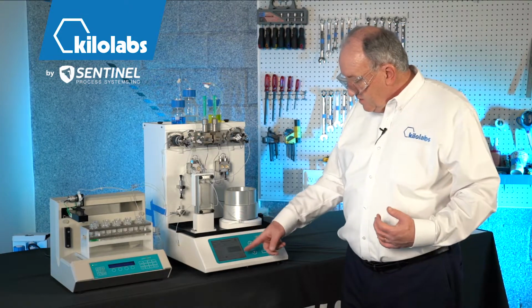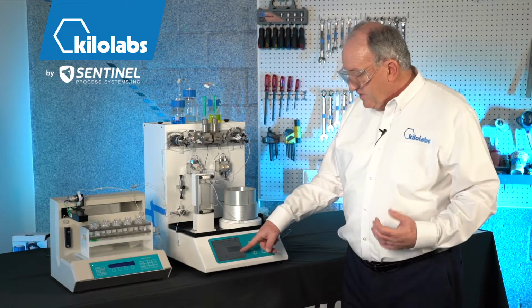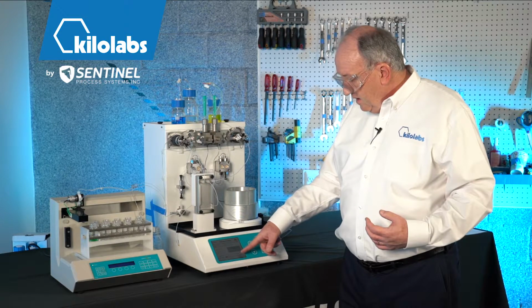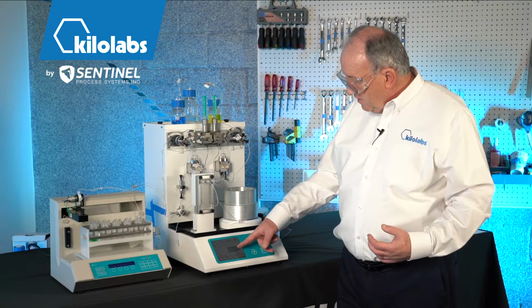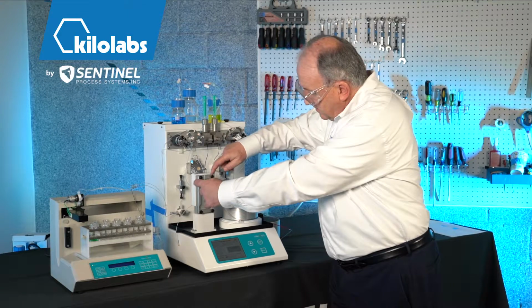This is the status, and you can see we're on number 2 out of 10, 3% of the way through. This is a much faster flow rate, and it'll only take about 4.5 minutes. We're waiting for the reagents to reach the reactor. The fluids are still coming down through the feed lines to the reactor.